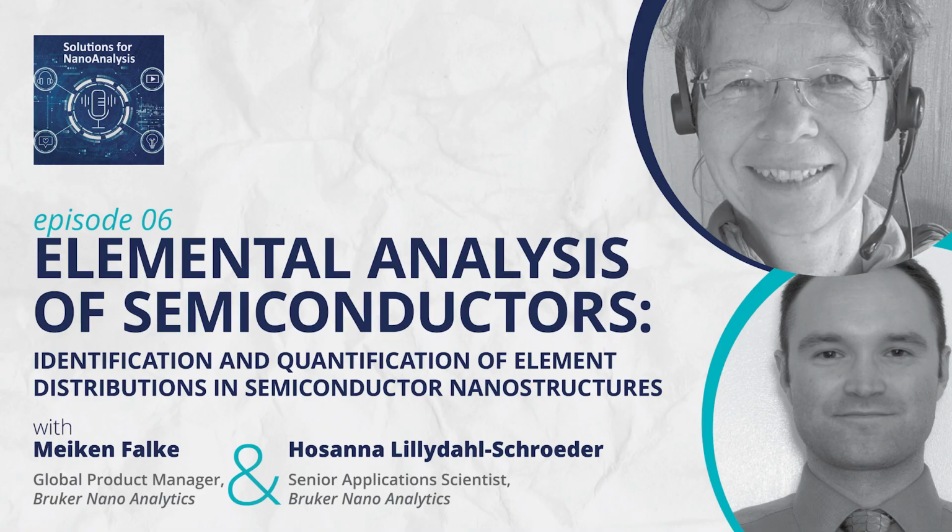Or deconvolved. All right. So you mentioned FIB work in your last discussion here. Speaking of focused ion beam, we discussed that with applications to TEM. But earlier I also asked you about SEM and different length scales. So what sort of things can we also do in SEM? Because with the field emitter technology that's coming out lately, there's almost some blurring of lines as far as what length scales you can really look at and investigate with EDS in SEM versus TEM.